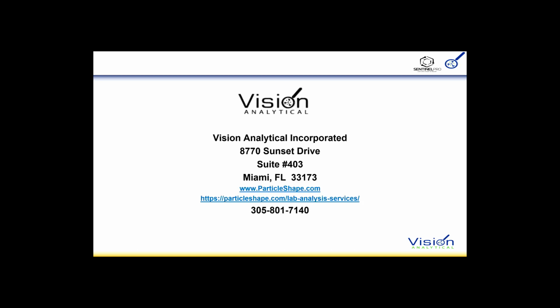Vision Analytical can run free sample evaluations for the standalone particle insight and shape module connected to the Malvern Mastersizer. Prior to scheduling any demo, we would like to perform sample analysis, free sample evaluation analysis, present our findings with a WebEx, and discuss our recommendations for moving forward. We ask that this is a prerequisite before considering moving forward with any on-site demo.